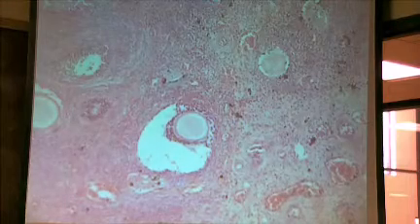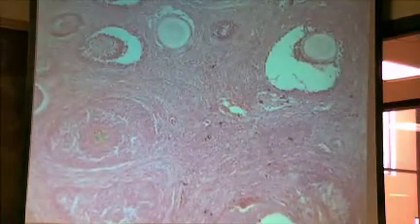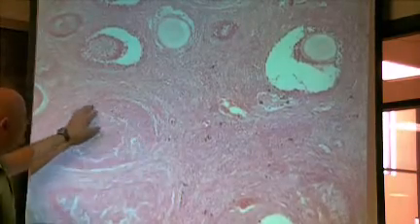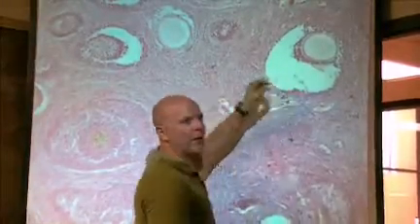Where were the secondary follicles again? Secondary follicles are all over the place, but to distinguish the secondary follicle, let me move these two here. This is showing a secondary follicle here. You don't have a clear antrum. You've got lots of cells here. There's the oocyte. All right. Here is a Graafian follicle. You've got a nicely defined antrum.